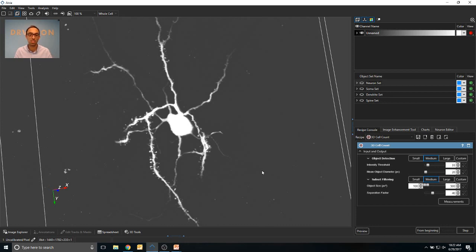dim light conditions. So in a microscopy facility, often people will do image analysis in the room adjacent to or even inside where the microscopes are. And in those rooms, typically there is relatively low light. And so to avoid eye strain, we've added this theme for your comfort.